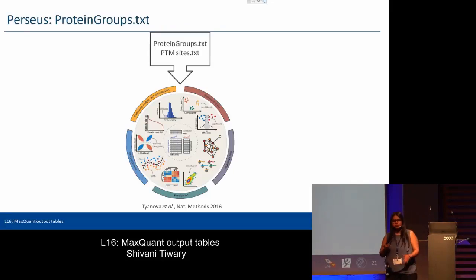And so the conclusion from this tab would be that you can use these tables and put them into Perseus and get your visualization done, and downstream bioinformatics data analysis can be done. And you can use this information for classifying and for GO enrichment, etc. So this will also be discussed because we will be using this table in the Perseus session.